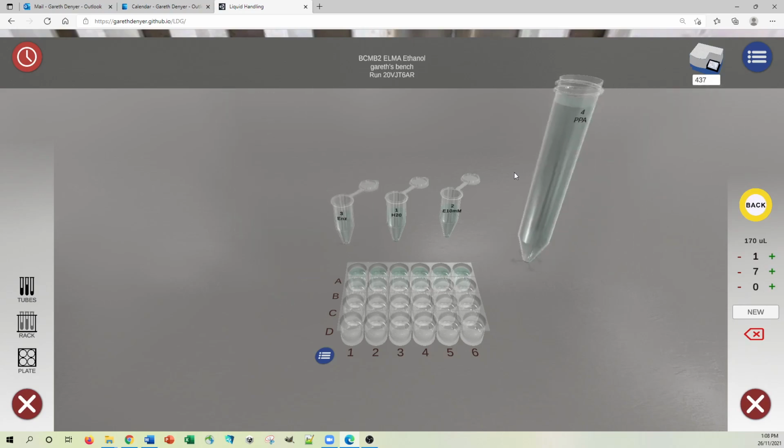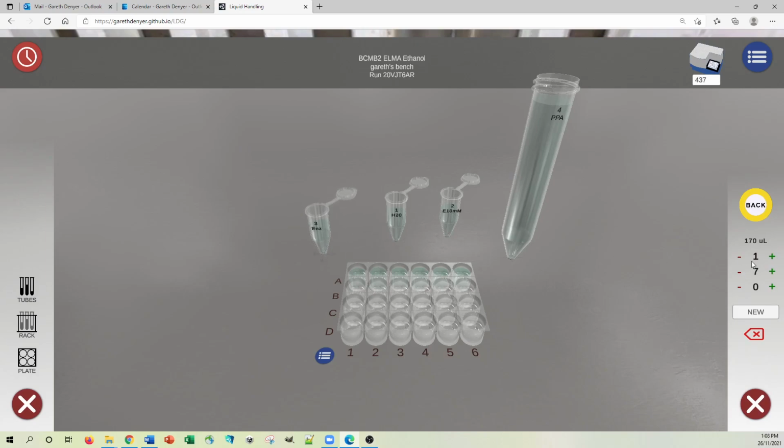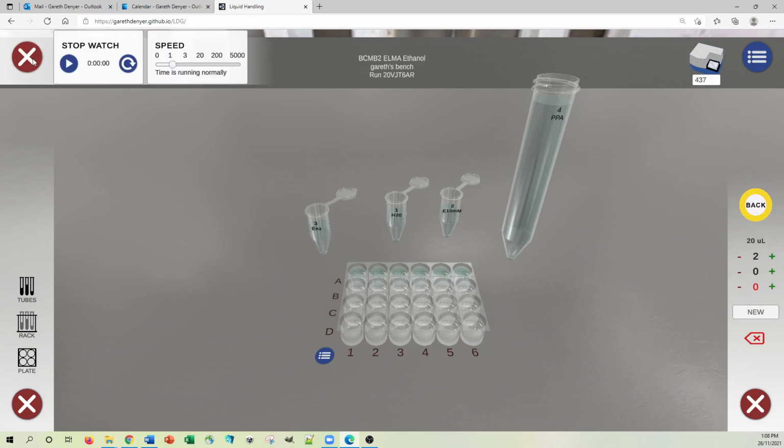Now, no reaction is going to take place yet until I put in the enzyme mix. So I'm going to put in 20 microliters of the enzyme mix. And before I do that, I'm going to start the stopwatch. So if I suck up some enzyme, start the stopwatch and start pipetting it into the first one, suck up some enzyme. And you notice I'm not changing the pipette tip here, which I probably should be doing, but the crossover of contamination is not going to be anything to worry about.